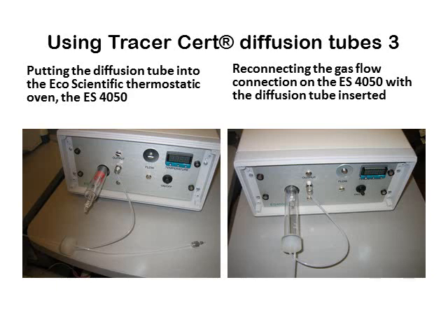After weighing the tube, carefully place it into the thermostat oven at the desired temperature with a piece of fine wire wrapped around the narrow neck between the two sections of the reservoir. This is a very simple way of enabling the user to pull the tube out with tweezers when taking it out for the regular weighings during calibration, as well as when you want to refill it.